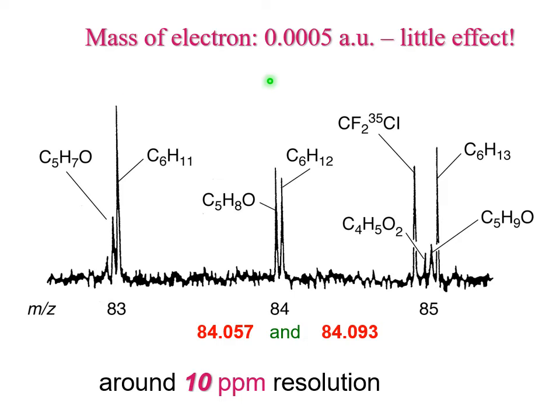We also have high resolution procedure, sometimes arrogantly named exact mass. So the masses are measured with at least 3 digits, better 4 digits after the dot.